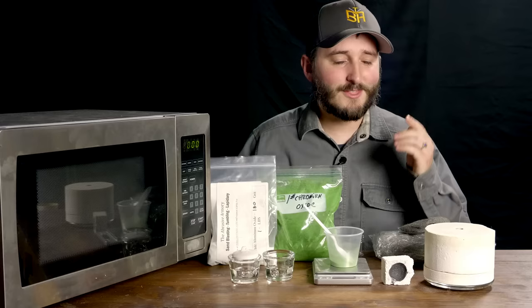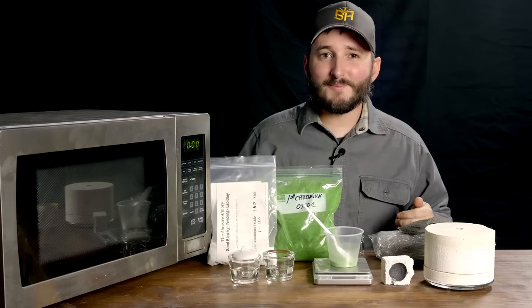Hi everyone! In this video I'll be showing a method to create synthetic rubies in a microwave.